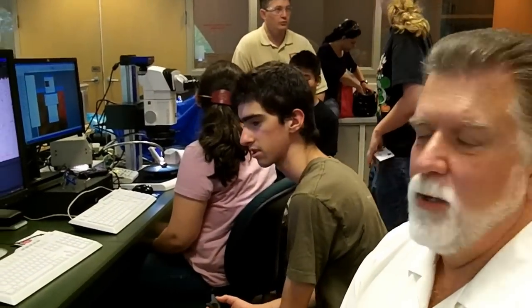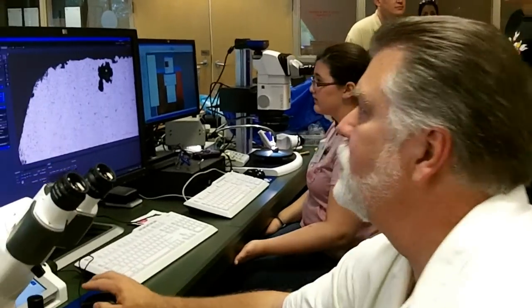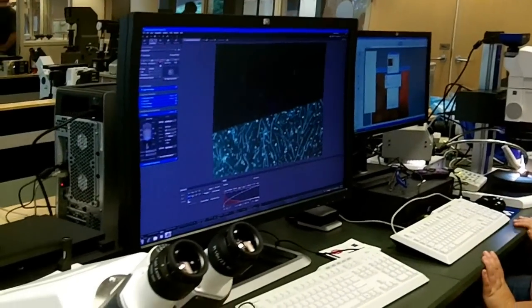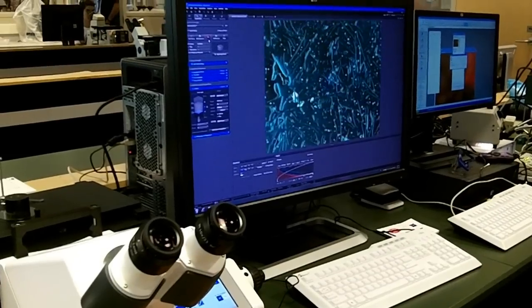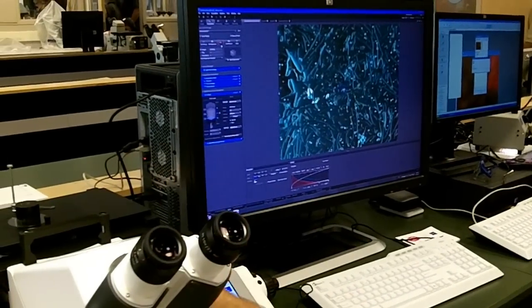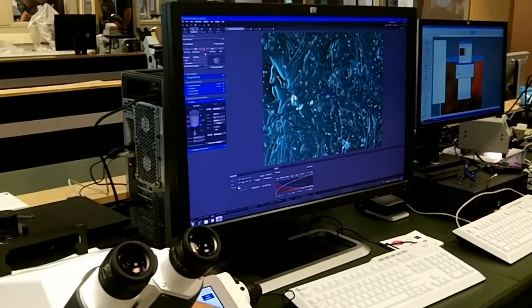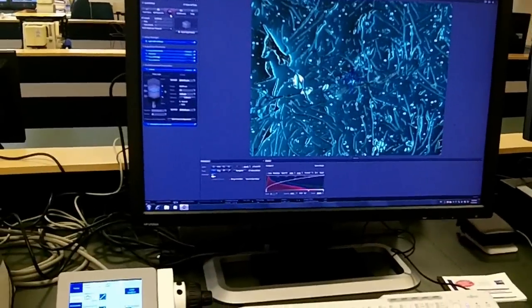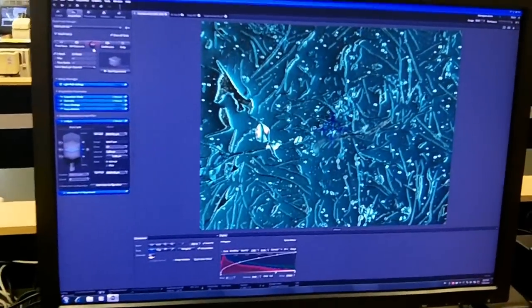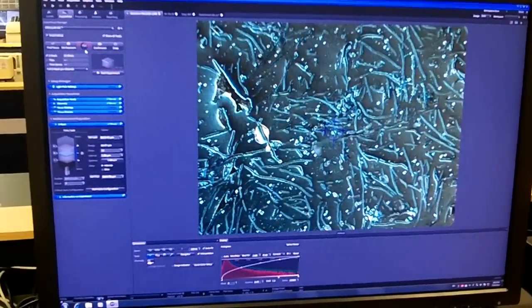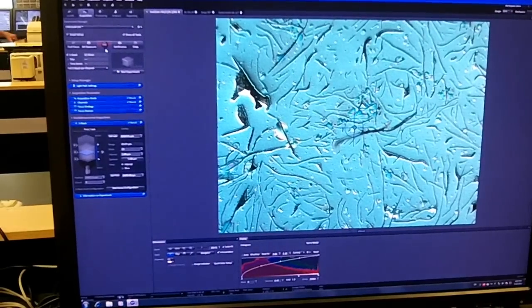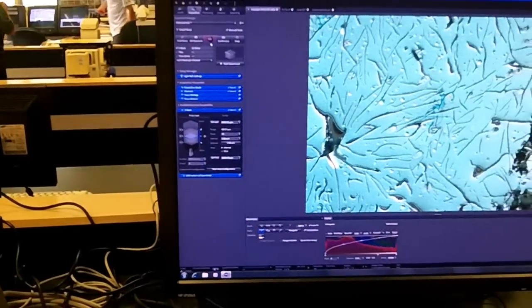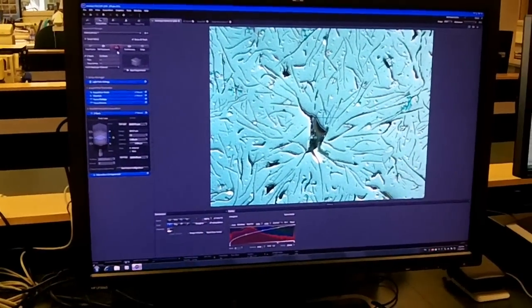So can you tell us what we're looking at right now? What we have now is a sample which is a gray cast iron, and we're looking at it in circular DIC. This helps bring out the surface structure, and we can change the contrast to different images of the sample to help really bring out the detail. We're looking at gray cast iron, and these are the graphite plates.